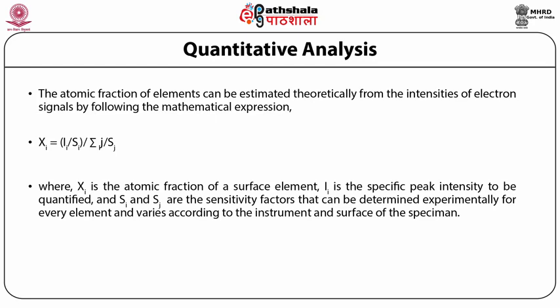The intensity of AES peaks is considered as the peak-to-peak height in differential spectra. However, the peak-to-peak heights depend on the instrument resolution and the differentiation or modulation processes using computer software. This problem may be resolved by using the AES direct spectrum. The presence of chemical contamination on the surface of the sample affects the accuracy of using equation 1.